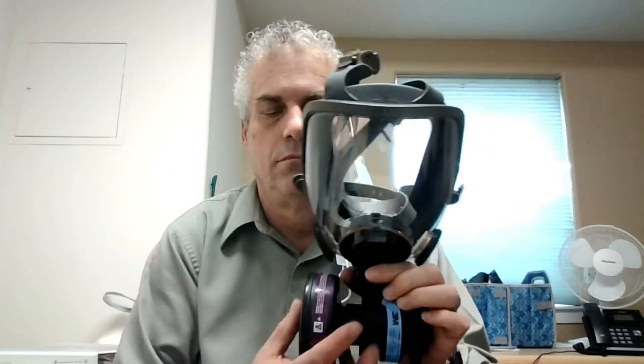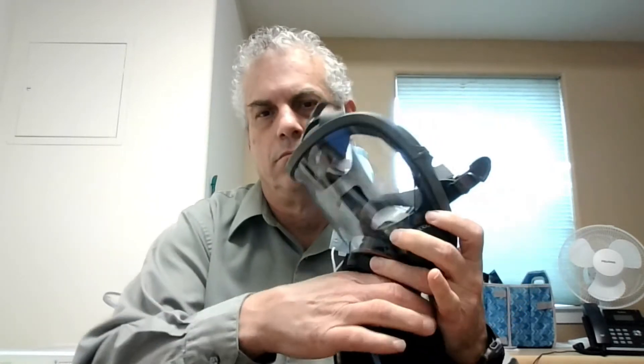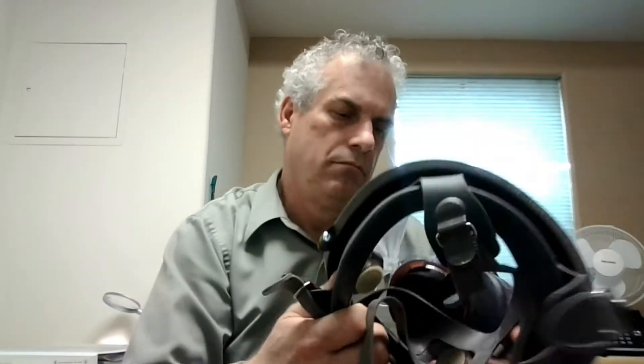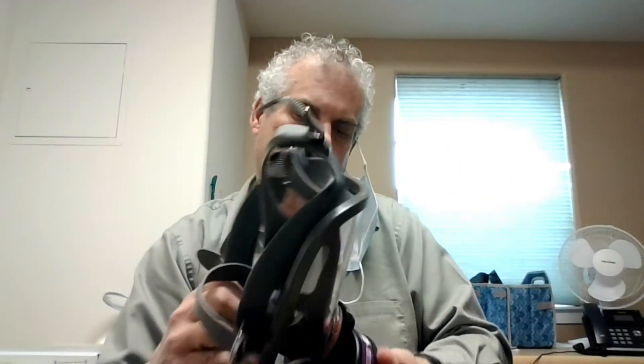A powered air purifying respirator (PAPR) typically blows air into your face. However, we seal check it in negative pressure mode with the fan off, or we can convert it into a negative pressure respirator — either with a single cartridge or in the standard two-cartridge configuration. When used like this, we have to plug the air supply valve used by the PAPR or the single-filter respirator mode.